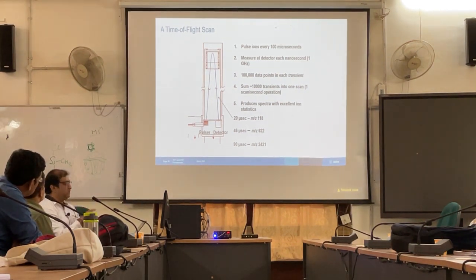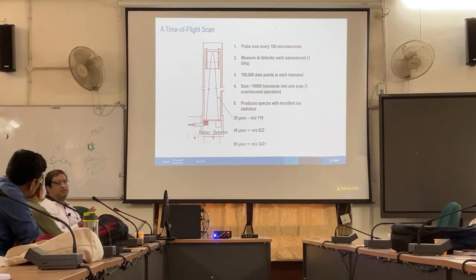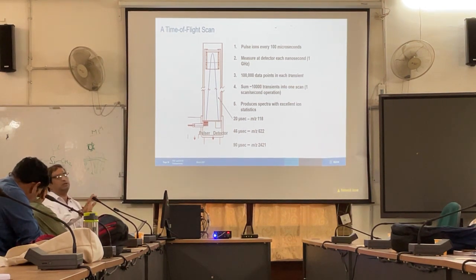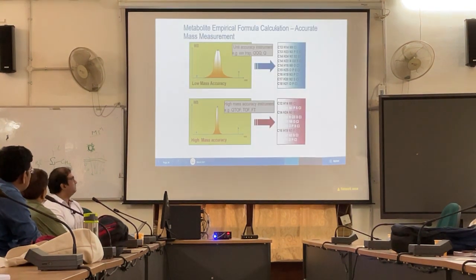The HRMS, because of the high scan speed, can be used for metabolomics very effectively because you can get basically 1 spectrum per second. Both quadrupole and TOF are serial based instruments, like you cannot continuously analyze it, right? So that is the reason TOF is mainly used for metabolomics or any omics for that matter.